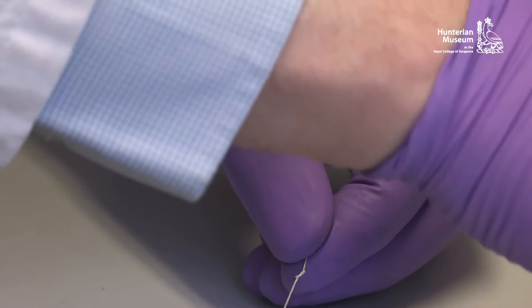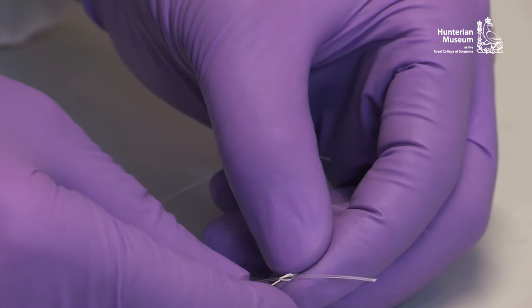For larger specimens, lengths of nylon are preferable as they evenly distribute the weight.